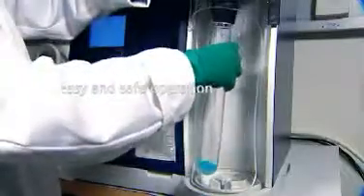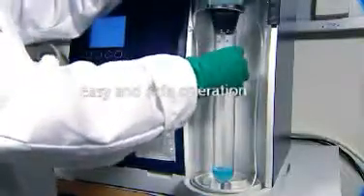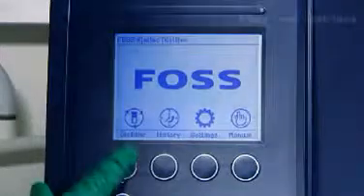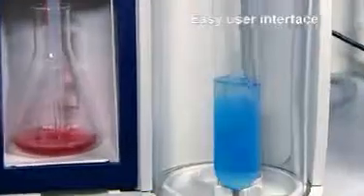Just load your sample tube, place the receiver solution flask, and close the door. Sensors for tube in place and the safety door ensure safe operation. Select the program and start the distillation.